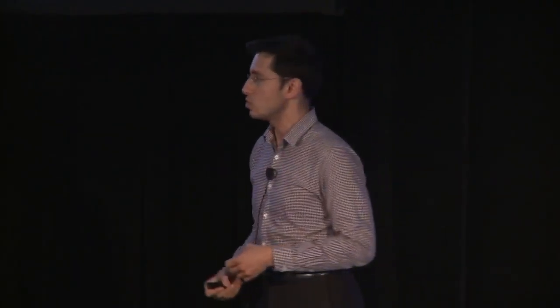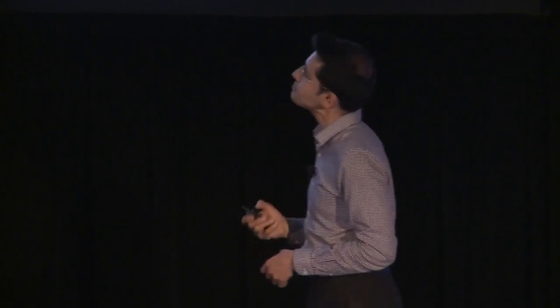So bringing all these acceleration techniques, improvements, and optimizations together, you can improve the performance of your pipeline by up to 2 to 3 times over the original baseline that almost everybody around the world is using, which is a significant improvement to the baseline.